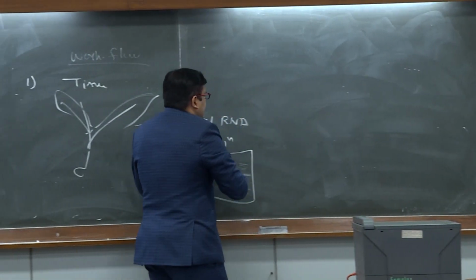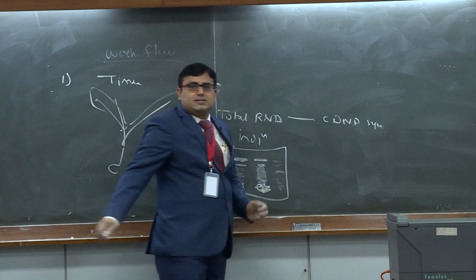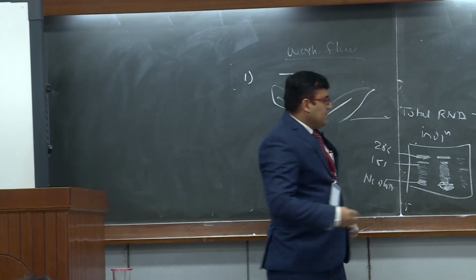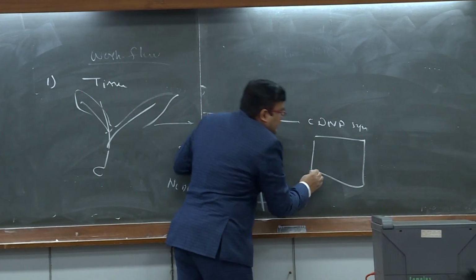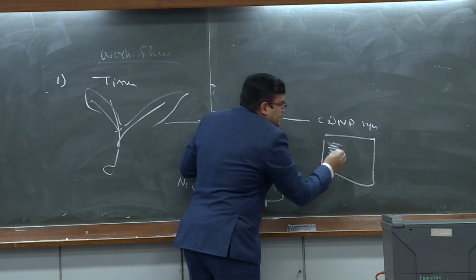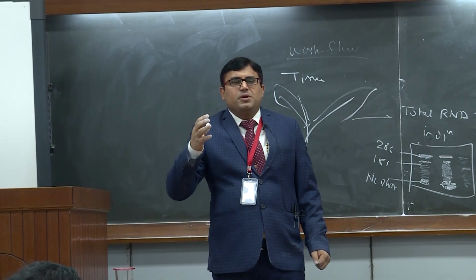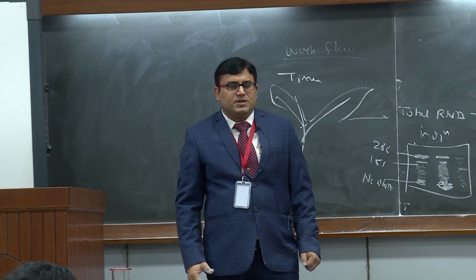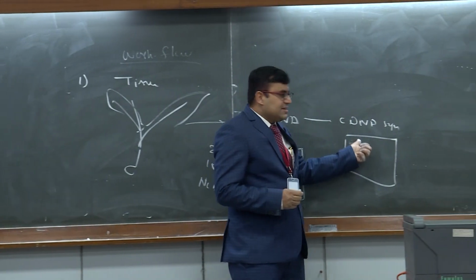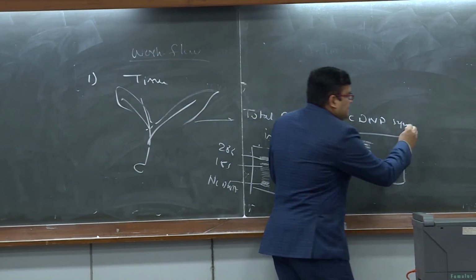So once you have isolated RNA, next is cDNA synthesis. I have already told you the kit, and I have also explained that when you run your cDNA, we expect a light smearing with a prominent band. That is the best quality RNA, cDNA. And once you check that your cDNA is of good quality, immediately you have to quantify this.